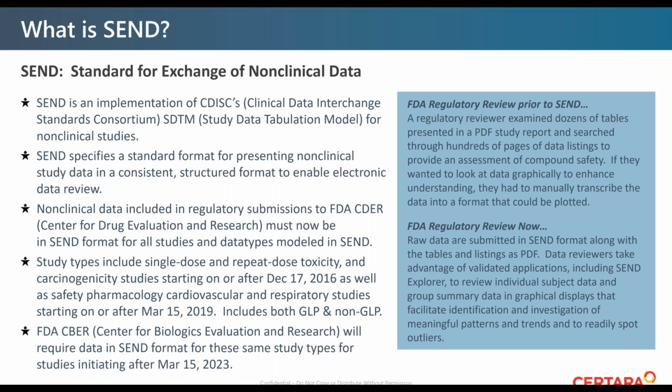And the FDA reviewer prior to SEND would have to flip back and forth between the report and the tables and the listings to try to understand what was going on in the data, to understand what the story was and what the impact of the treatment on the subjects was during the course of the study. And this was very time consuming. If they wanted to get any kind of visual look at the data, they would actually have to transcribe the data manually into a format that could be plotted, perhaps in Excel or some other format.